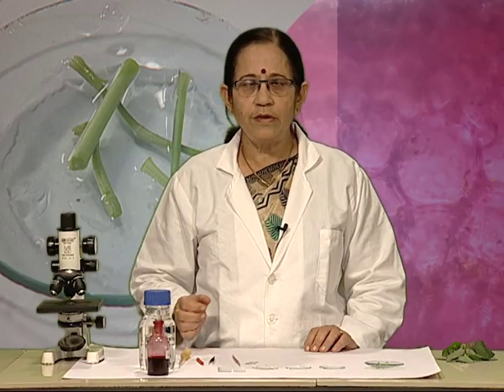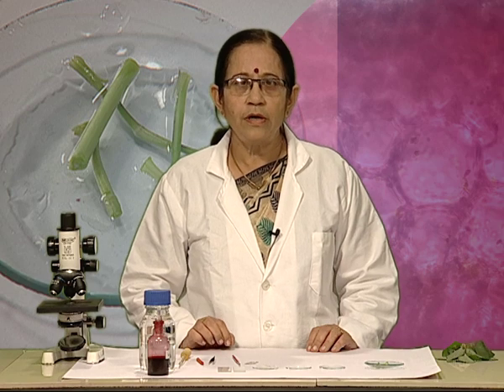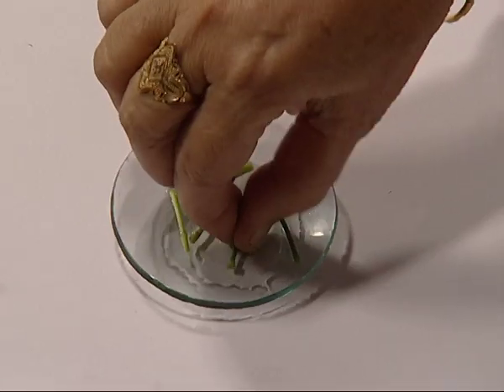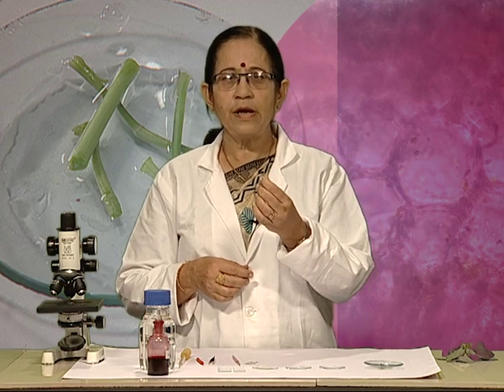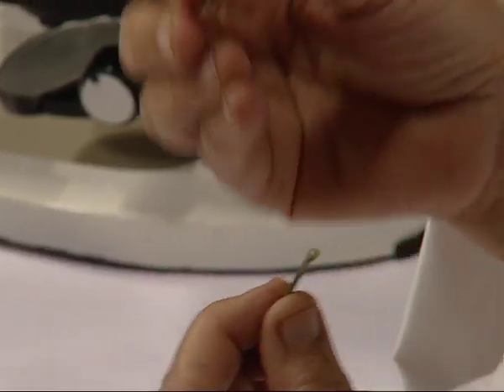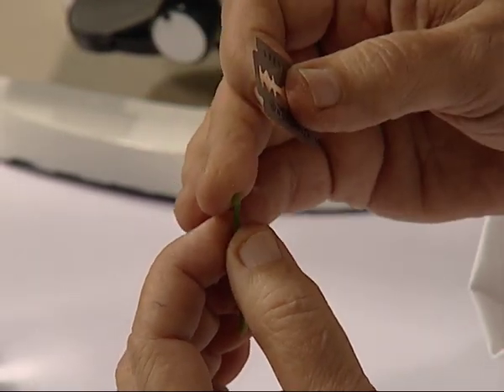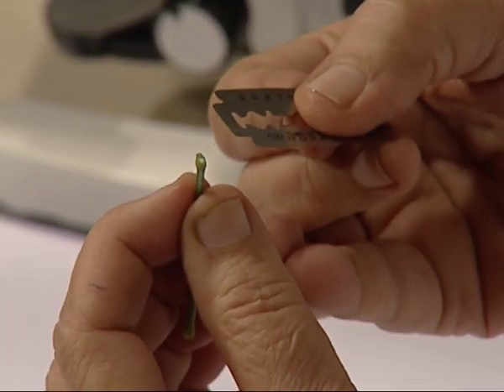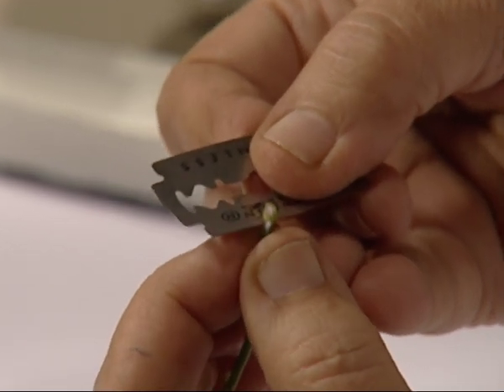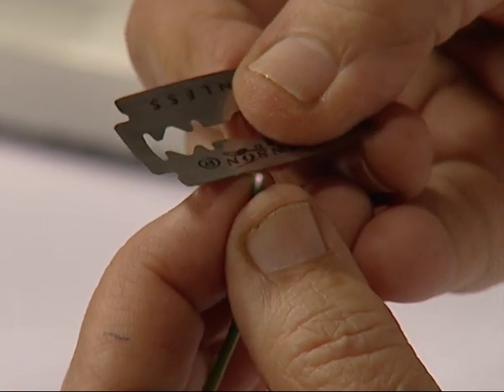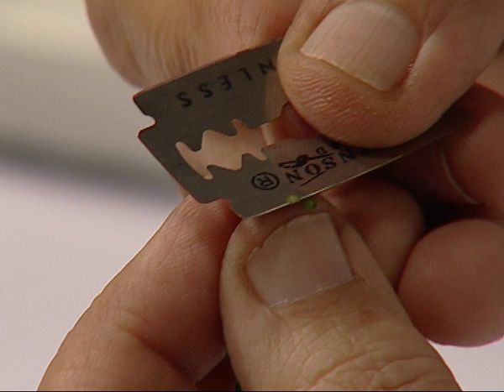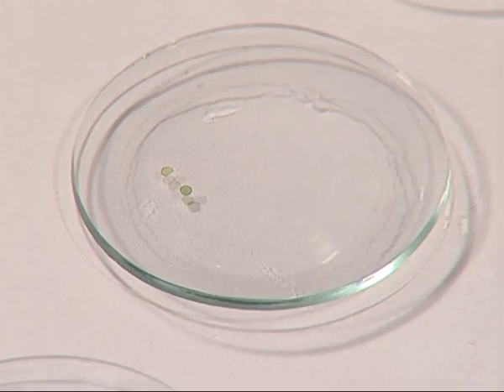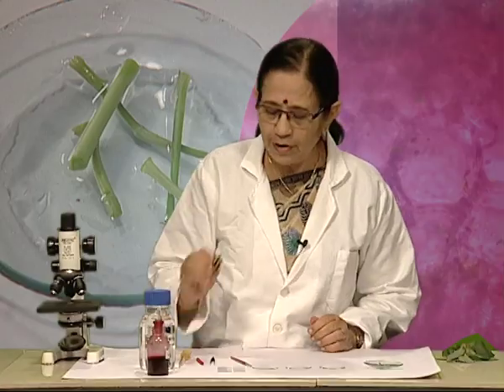Now let us start cutting the section of a stem. For this, you need to hold the stem in your left hand in an upright condition and hold the razor blade at right angles to the axis of the stem. Try to cut very thin sections of the stem — as thin as possible — and then put these in water. Here you can see I have cut sections of the stem and put them in water.